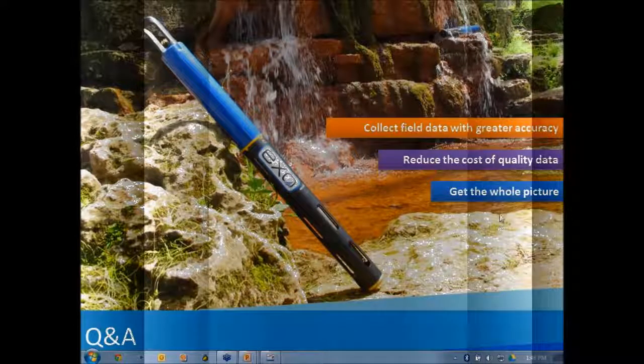So you develop a correlation curve for one reservoir, and then go and take a couple spot samples at the other reservoirs and see how closely they come to your predicted values. If the dynamics, the concentrations, the speciation at each of those sites is consistent, which it very well can be, then it's likely your calibration correlation curve will be consistent across those reservoirs.